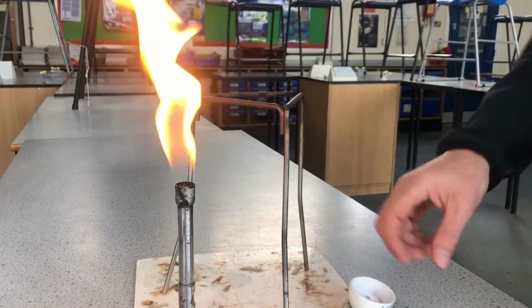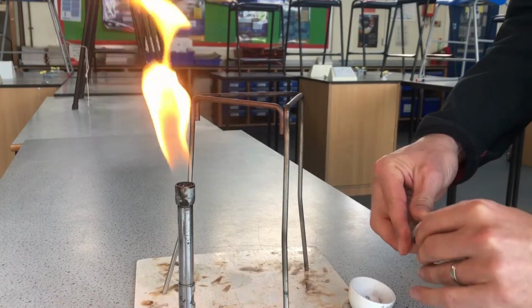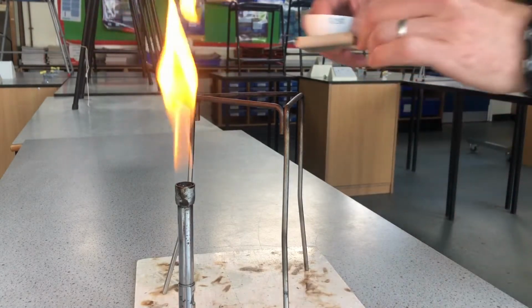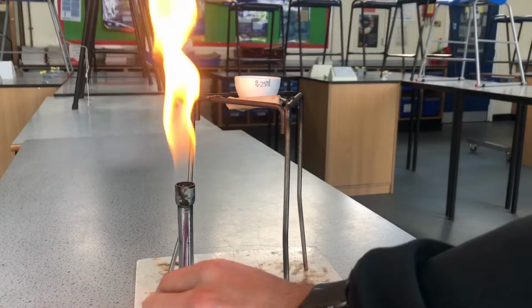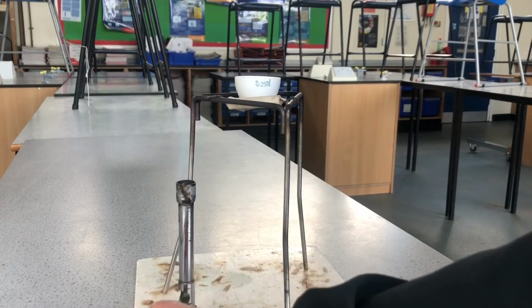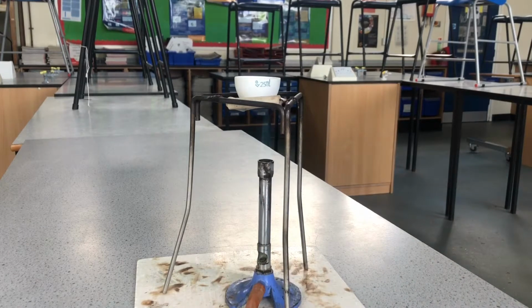So to get this experiment started, first thing we need to do is get our magnesium ribbon nicely in that crucible. Now we really should have a lid on it, because when we heat it, it's going to burn, oxidise with the oxygen in the atmosphere. And some of that magnesium oxide might be lost if we don't have a lid. Having said that, I need to get this done quickly today, so I'm not going to put a lid on. We're going to need a roaring Bunsen flame, because to get that reacting, it's going to need to get very, very hot. So the magnesium is very flammable, but we're not heating it directly with a flame, we're heating that crucible. So it's going to take a little bit longer to get going, that's why we need that roaring flame. So we'll leave that going.